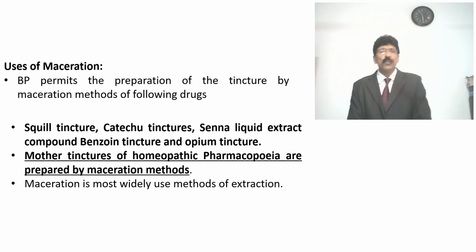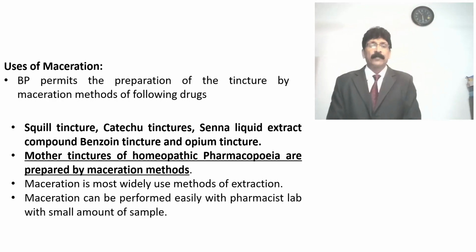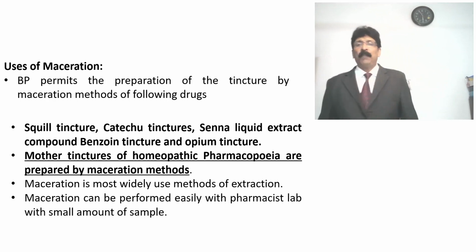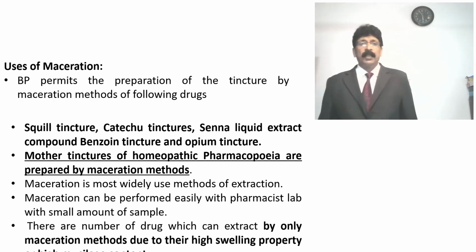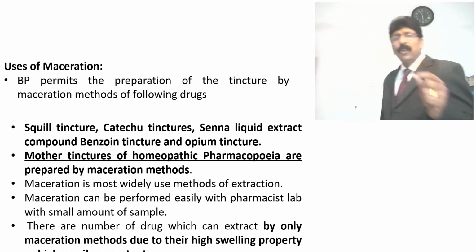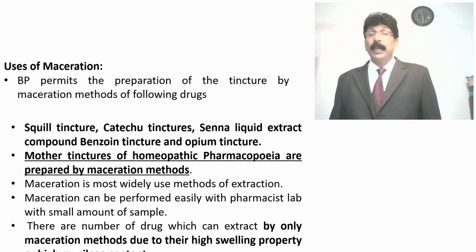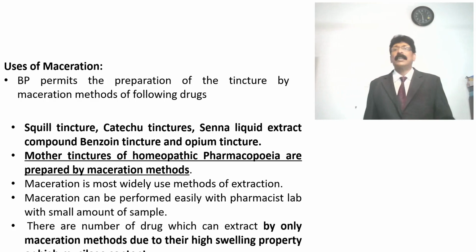Maceration is a widely used method of extraction. Maceration can be performed easily in a pharmacist's lab with a small amount of sample. There are a number of drugs which can be extracted only by the maceration method due to their high swelling property or high mucilage content.